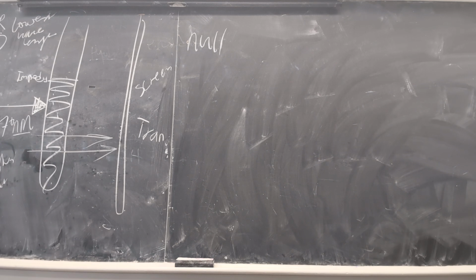Okay, add water in there. Add like 1 milliliter of water. Okay, listen up. Hold on. Everybody, stop, look, and listen. I forgot to tell you something.